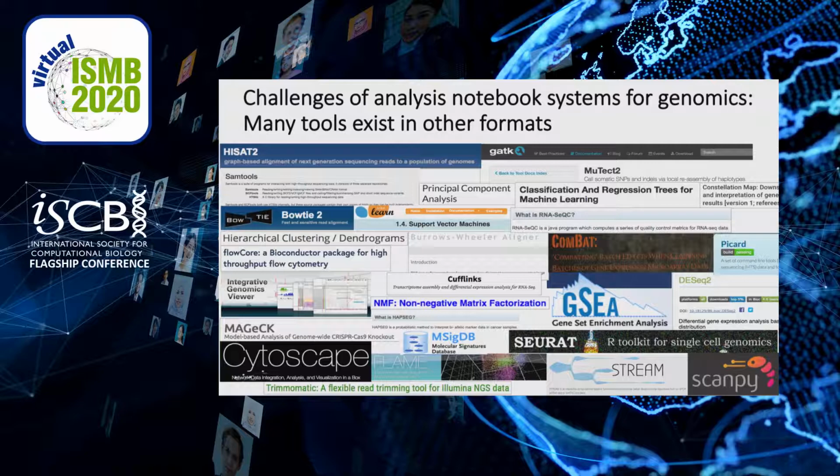Also important is that many bioinformatics analyses are compute intensive. You might want to create a workflow that includes RNA-seq analysis, non-negative matrix factorization, or other tasks that would overwhelm the compute capacity of the machine running your notebook server. This is especially true in environments that provide hosting for multiple Jupyter users through JupyterHub. It would be ideal to offload compute-intensive analyses to the resources best suited to support them.